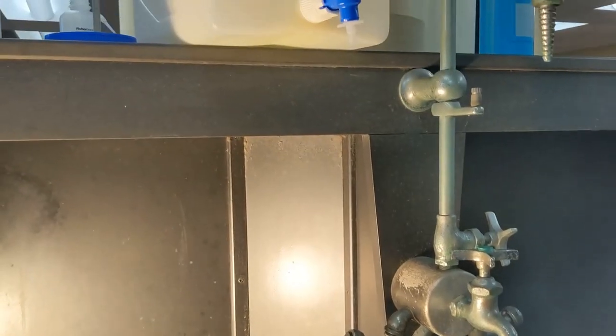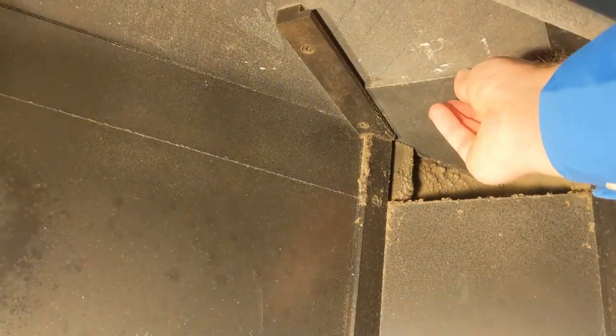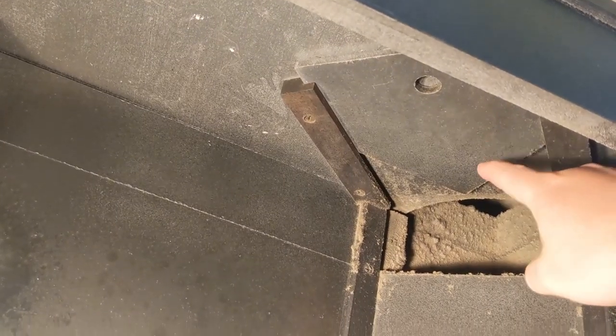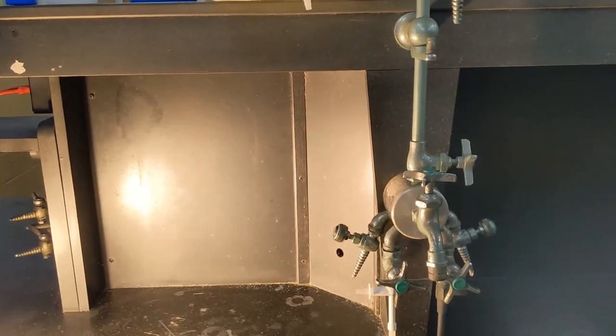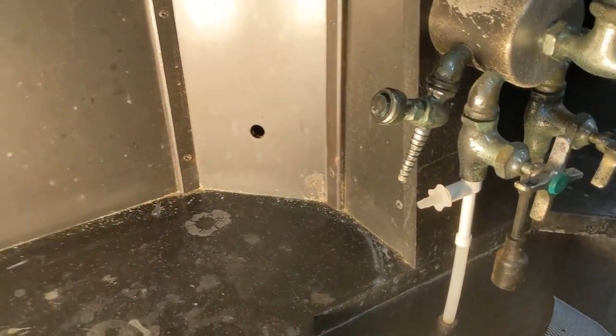At your lab station, you have this mini hood where if we bend down, you can see there is this gap here. If we open this sliding piece of wood, we now have quite a good bit of air that is being exhausted up through this pipe. This is the pipe that is above the sink in the lab. And so this space acts as a mini hood under which you can keep fumes relatively contained as they'll be exhausted up through that vent.